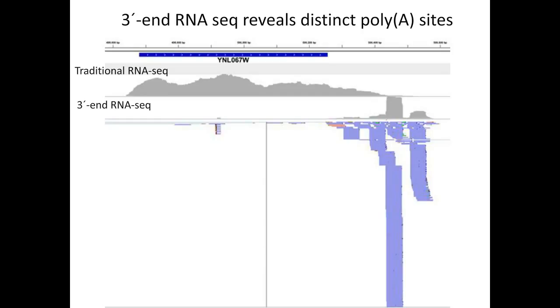The 3' end sequencing, however, only focuses on the 3' end and is very efficient at detecting exactly where these transcripts end. So you can see that with 3' end sequencing, there is one major polyadenylation site, but there are also a few other poly-A sites in this transcript that would not be well identified with the traditional RNA-Seq method.